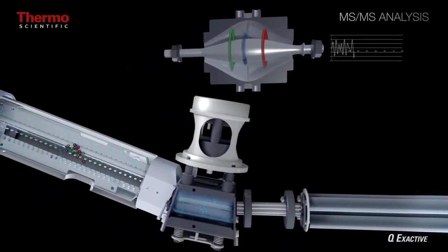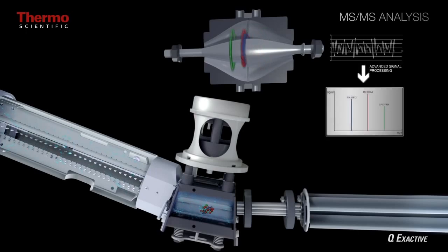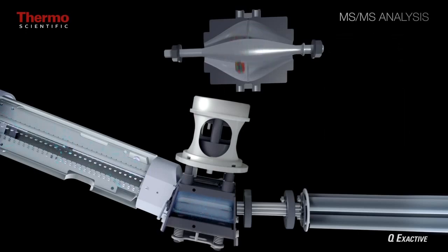When this scan is completed, another set of ions are selected for subsequent fragmentation in the collision cell and detection in the orbitrap. This process occurs for all ions that are to be fragmented over and over again.